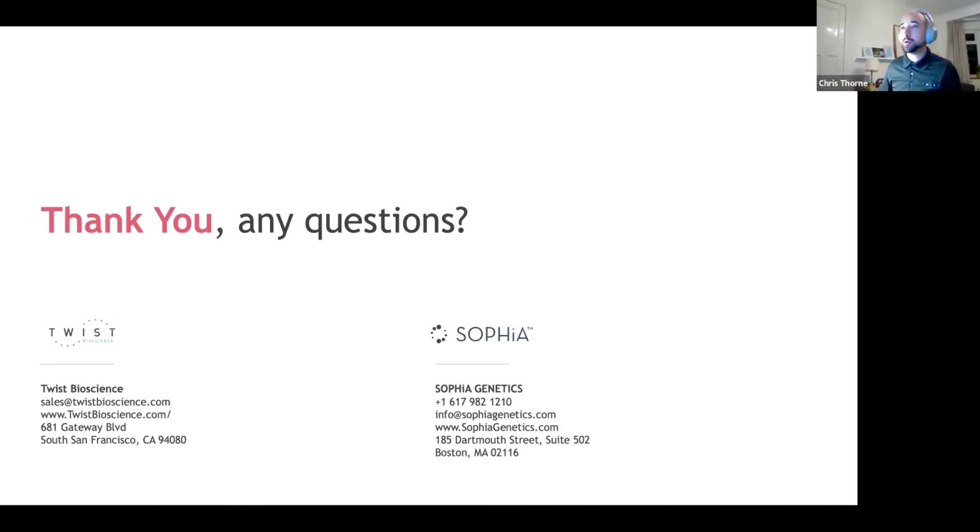Well, Rodrigo, I hope that gives you suitable material to make the case where you are. I will just answer one final question then, which is again from Rodrigo, and then we'll call it there. So what would be a good way to get inversion with a custom design panel? So in this case, like Boland mutation in the MSH2 gene, would this be possible? I'm going to let Emily talk about this one a little bit, and then I have an idea too.